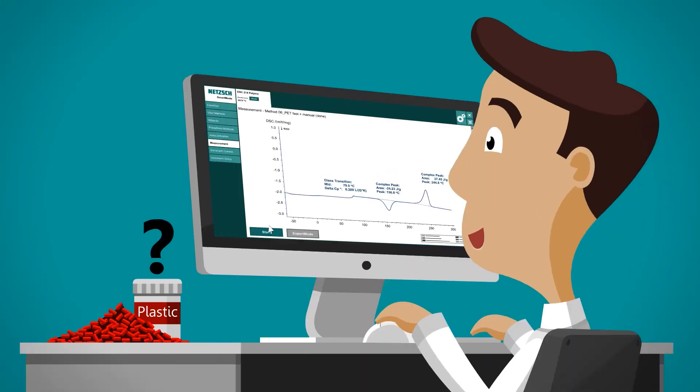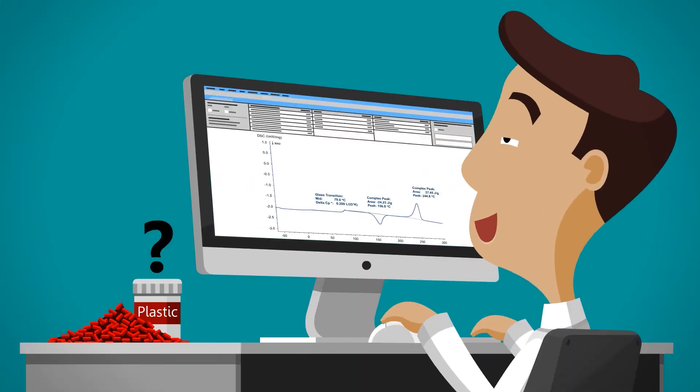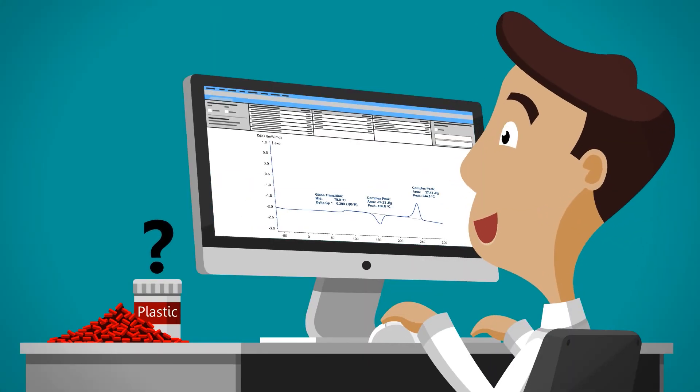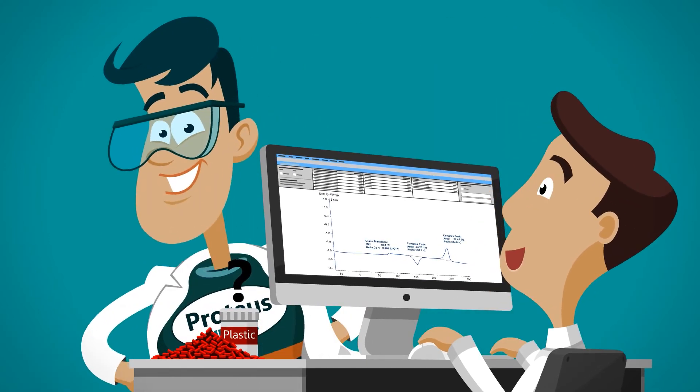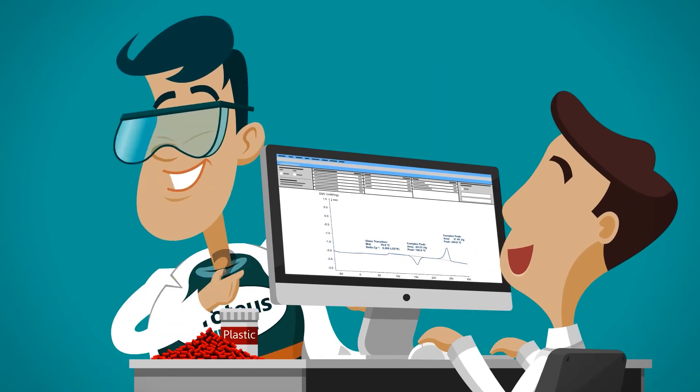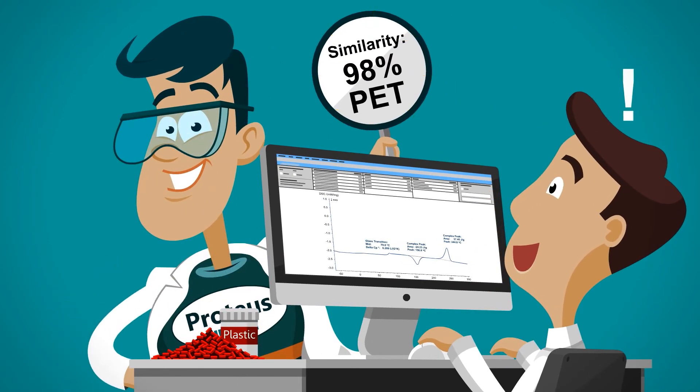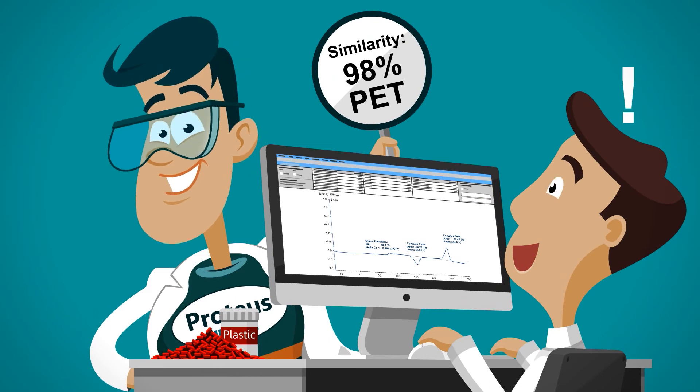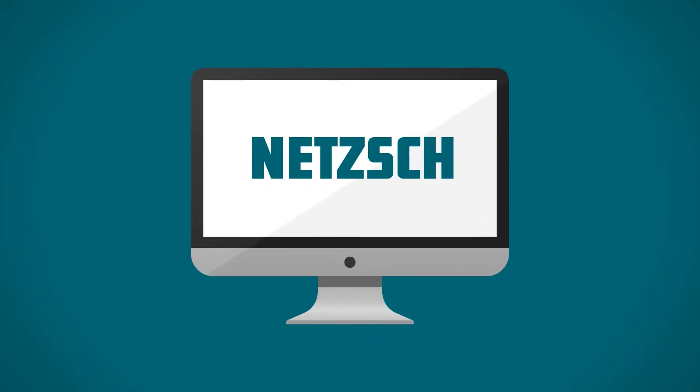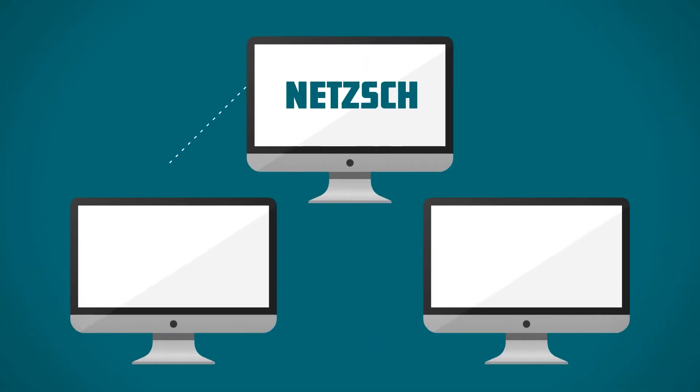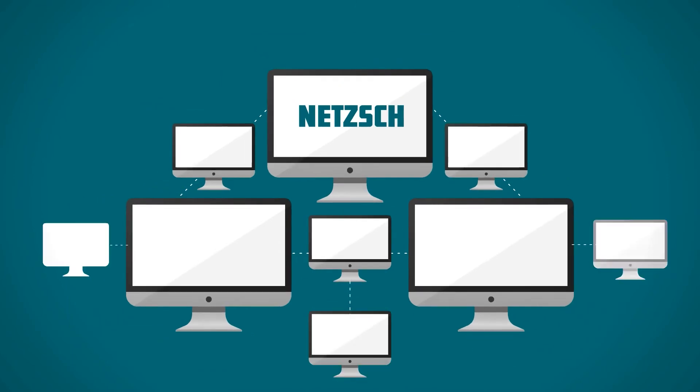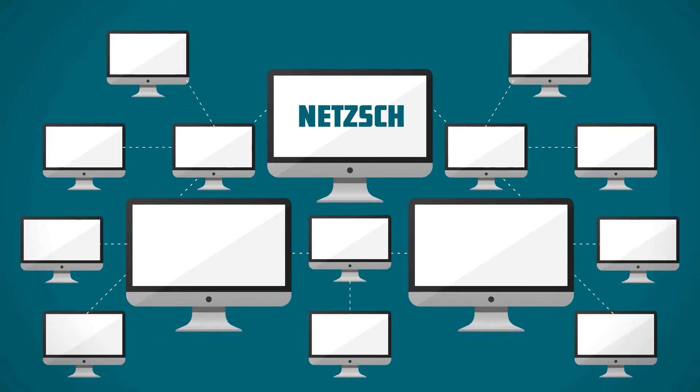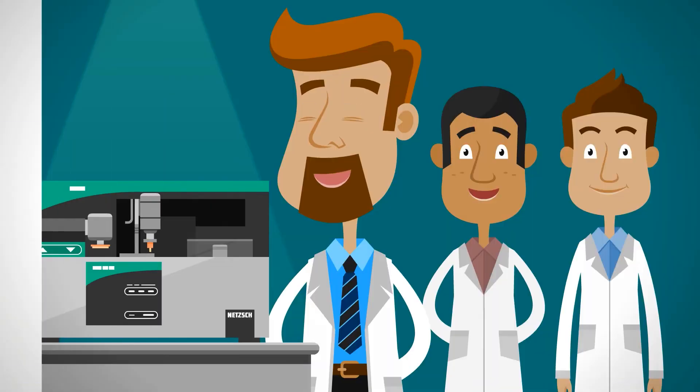As a next step, the Identify database helps in the interpretation of materials without the need for any tedious literature research. Users may also create their own databases with Proteus and share these within the team.